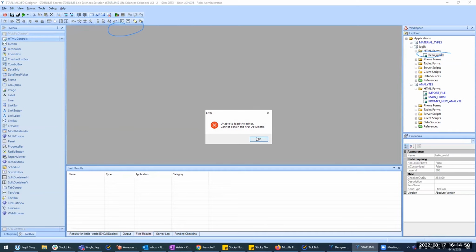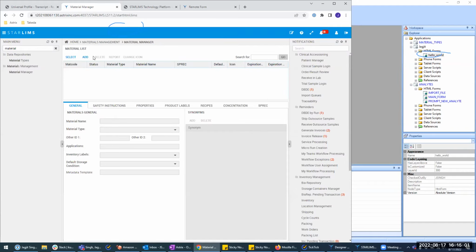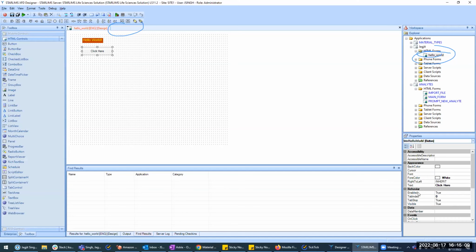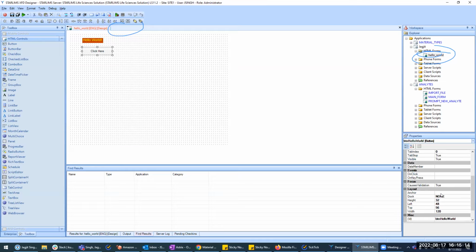Oh man, can we check maybe your session or something on STARLIMS? Go back to, yeah, go back to, that was why. Yeah, so welcome to STARLIMS. All right, let's go back in there. I think we lost all of that stuff. All right, no, maybe the form's not still there. Yeah, maybe not. The event is lost. Okay, let's just do it quickly so we can move on to the next.